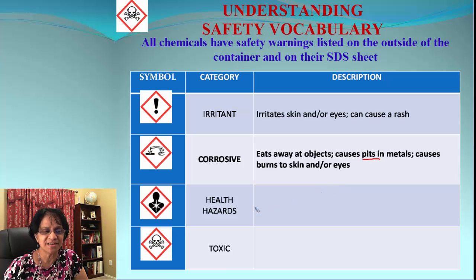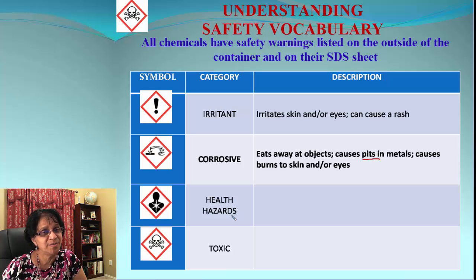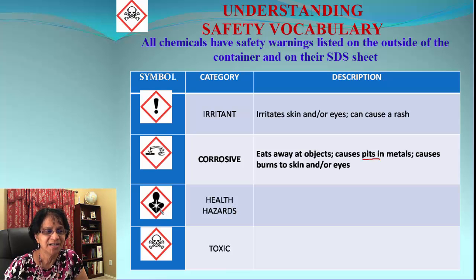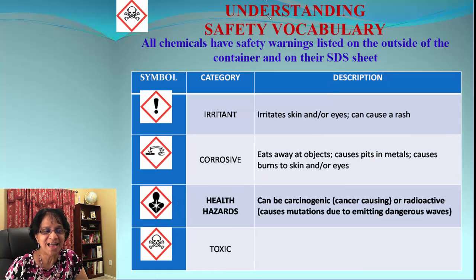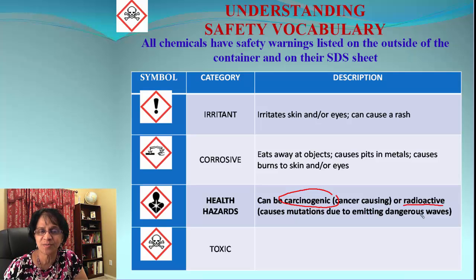Next is health hazard. Some chemicals may be dangerous to us, and the effect may be quick or long-term — maybe showing up after a couple of months. The GHS symbol has a shiny star with a human body, indicating it's about health. Some of these could be carcinogenic substances which can cause cancer; some could be radioactive substances, which are even worse because they can cause mutations. We'll learn about both of these later.